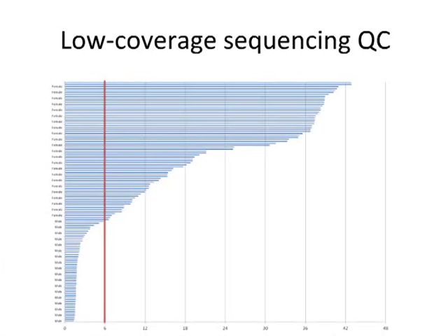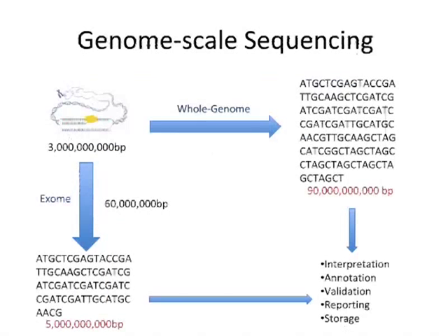We intentionally set the plates up during cherry picking to have a fairly equal representation of males and females through the plate, with as close to a male-female alternating pattern as possible, to be able to look for technical mixtures, which fortunately are extraordinarily rare.